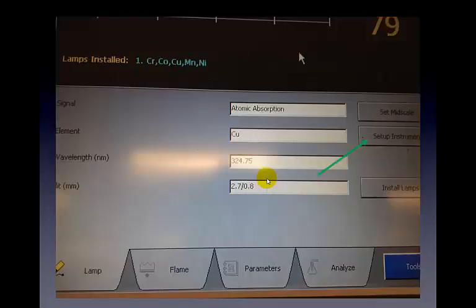The text boxes are now populated with parameters associated with copper — you can see the element, a wavelength already chosen, and a slit width. The wavelength is selected based on the most common and best wavelengths used for copper analysis. Typically you'll use the default, but if your protocol calls for a different wavelength, simply click the text box and select it. Once all parameters are set, press the Setup Instrument button as indicated by the green arrow on screen.